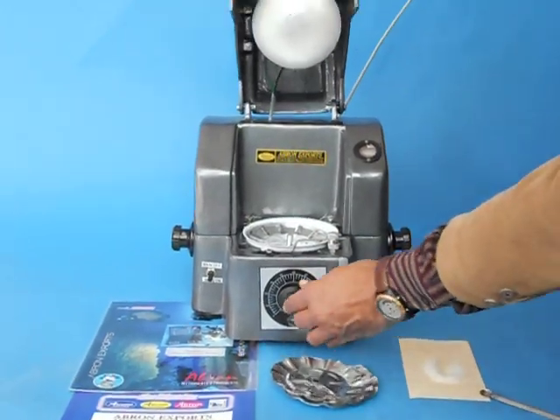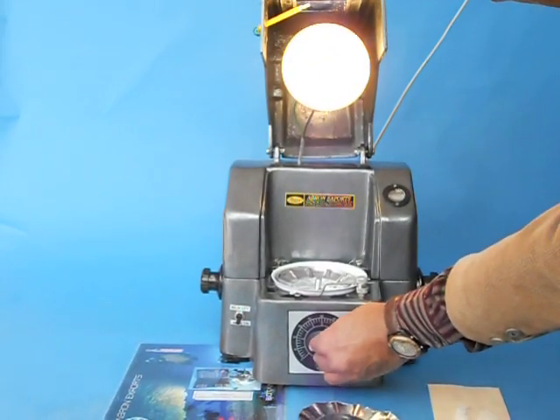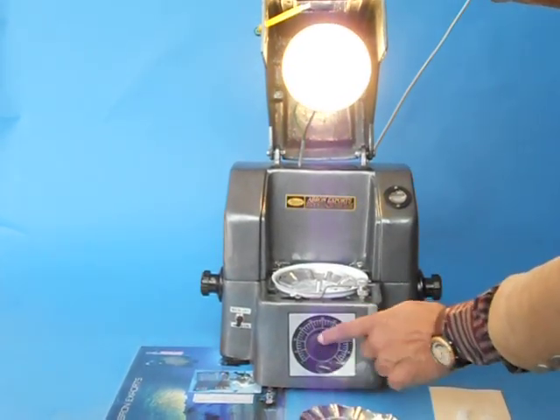There is an infrared lamp which runs with the energy regulator.